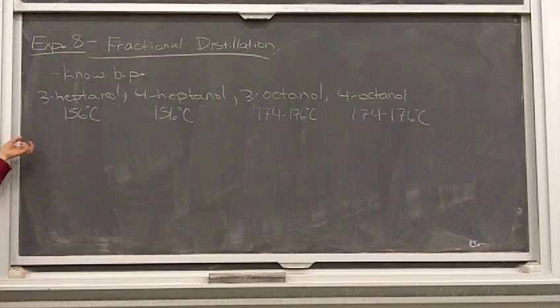With these distillations, what you want to do is start collecting about 20 degrees below the boiling point, okay? And then you could collect multiple fractions of the product. We'll probably use all the fractions that we call product in Experiment 11, but if you want to, when you get up to the boiling point of your alcohol, collect a more pure fraction for GC and IR, that is fine. So you could collect alcohol from 20 degrees below the boiling point up to the boiling point, and then try and collect more pure alcohol. And then you really shouldn't be eclipsing the boiling point.